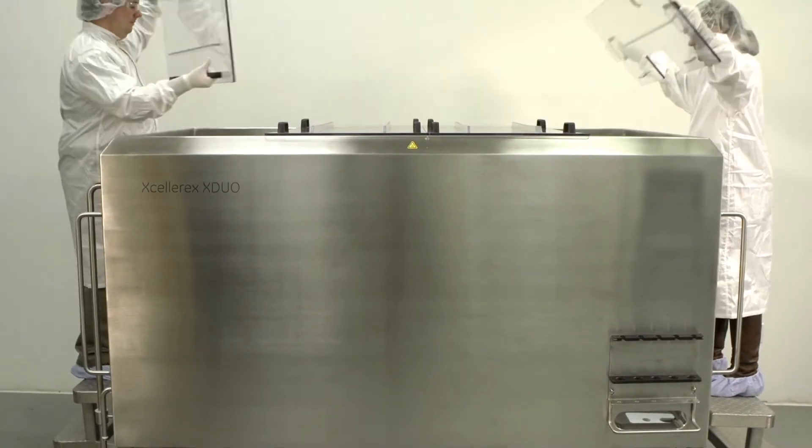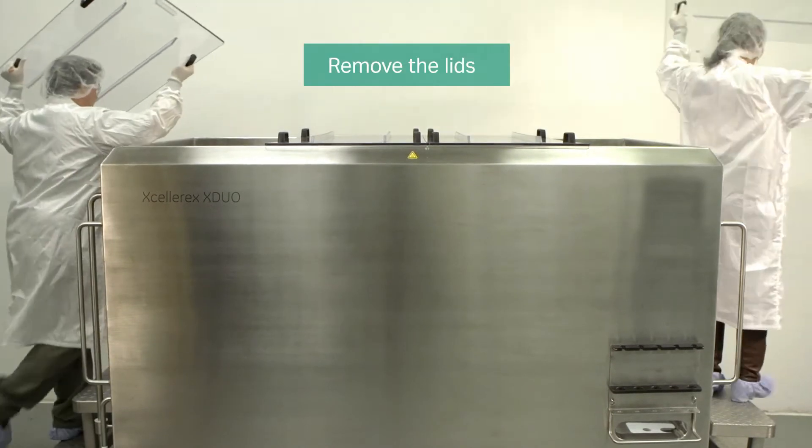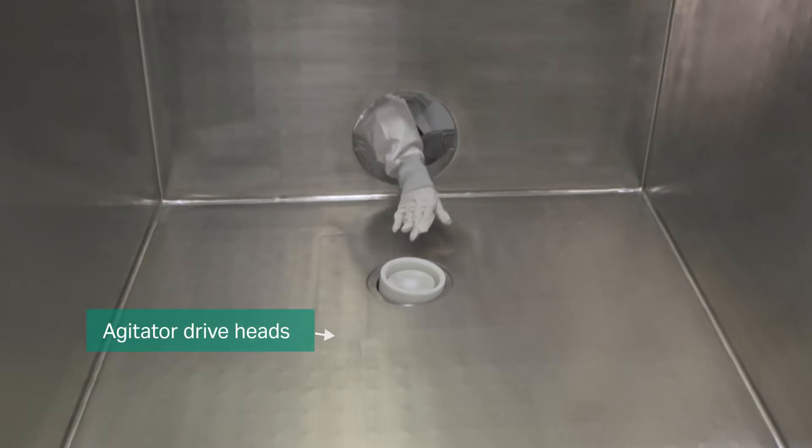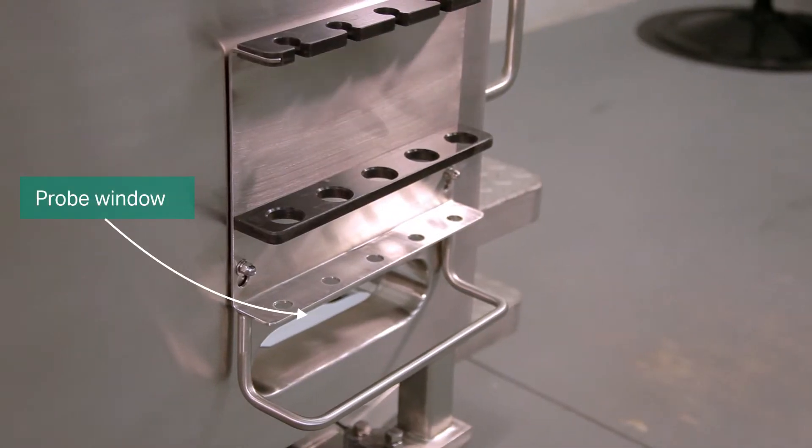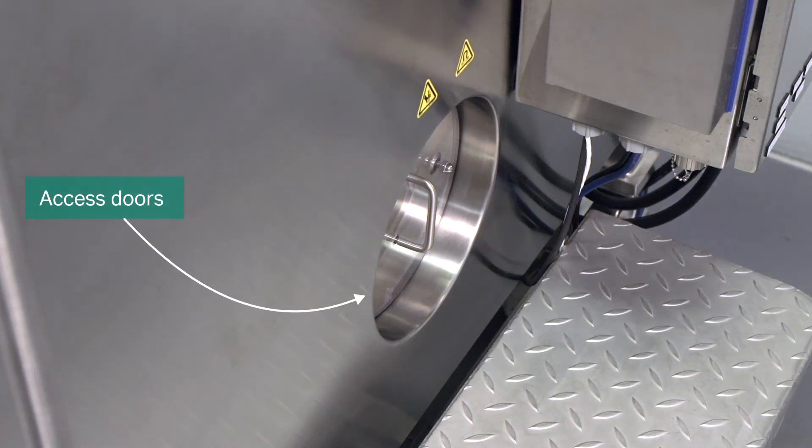Before installation of the disposable bag, remove the lids from the top of the vessel and locate the agitator drive heads, drain opening, probe window, and access doors on both sides of the vessel.